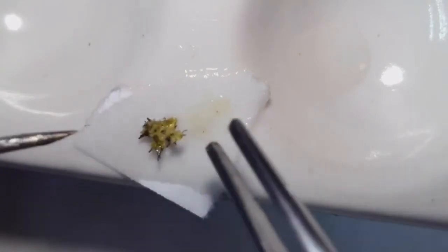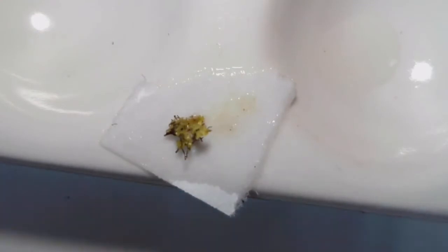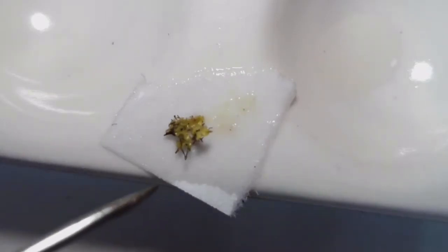And then just make sure that you kind of mush your lichen in there. I usually take it out just because if there's too much of the reagent and it's a subtle change, then it can kind of wash away the color change. But in this case, we can see that there was a brief yellow color change.